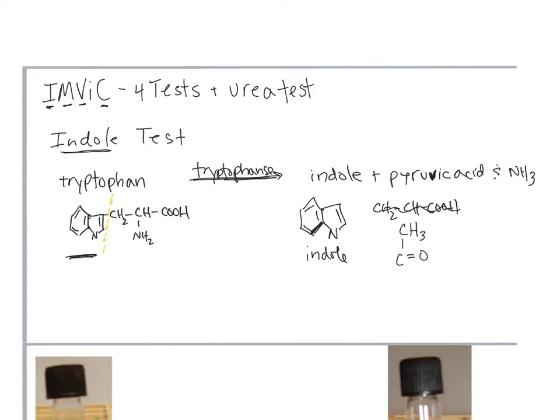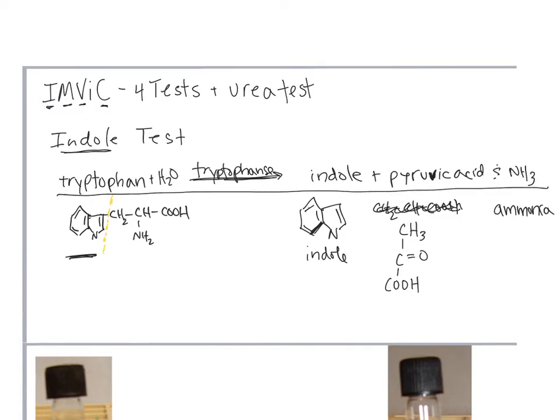I forgot an oxygen, and I was counting my oxygens and it didn't come out right, because actually there's some water in here. And this is ammonia or ammonium, NH4, one or the other. Oops, sorry about that. Anyway, this is the reaction that you should be familiar with.